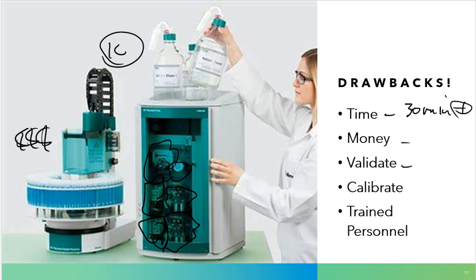Next up is validation. This is something I don't really do, quite honestly, this whole validation step with reagent-based identification tests, but instrumentation does need validated, and it does need to make sure that it's working the proper way. Next up is calibration as well. That could be a different thing. That calibration is making sure that it's seeing things on scale or in proportion that it needs to see them. So as I make stronger concentrations of something, does that machine go up and up and up? That is a calibration technique.